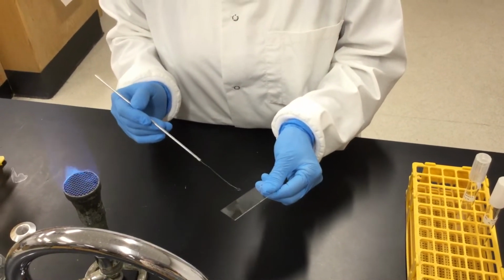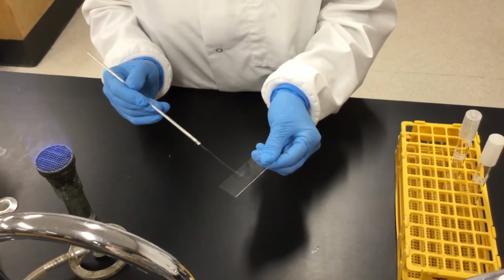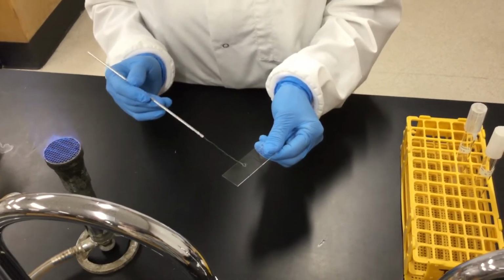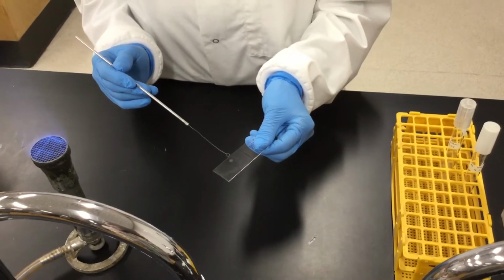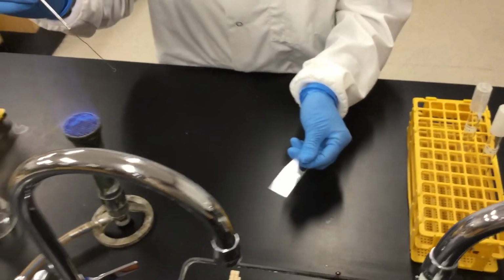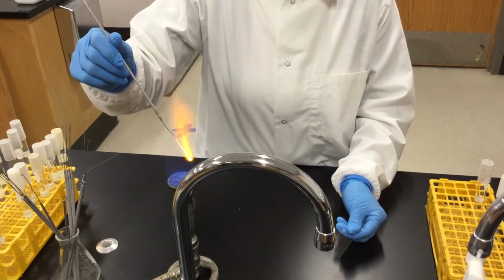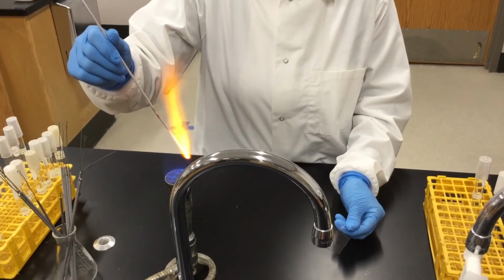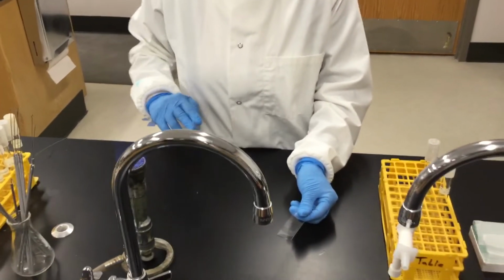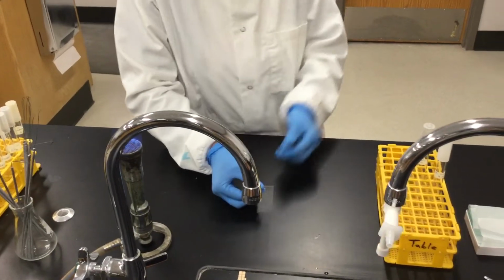It's hard with the camera, but I can see the whitish color coming from all of these bacteria mixed in the water. So I have done that. I'm going to sterilize my loop, and you can see even the spattering of the bacteria there as it's being killed, and wait for this to dry. And I'm going to grab another clothespin.